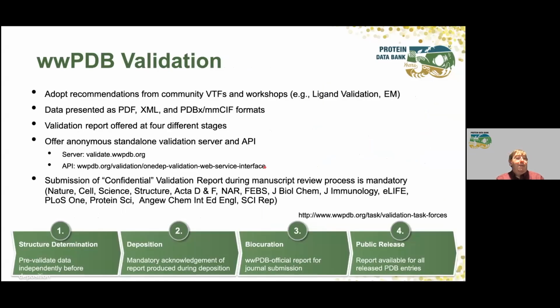So I kept talking about validation. What we did was we adopted recommendations from validation task forces and workshops. We have them on X-ray, NMR, EM, and ligand validation. The software was developed with that in mind. Data are presented as either a PDF file, XML, and mmCIF, PDBx and mmCIF formats.